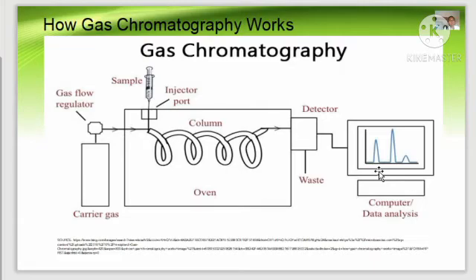Usually, the first peak is from the inert carrier gas, and the next peak is the solvent used to make the sample. Subsequent peaks represent compounds in a mixture. In order to identify the peaks on a gas chromatogram, the graph needs to be compared to a chromatogram from a standard known mixture to see where the peaks occur.